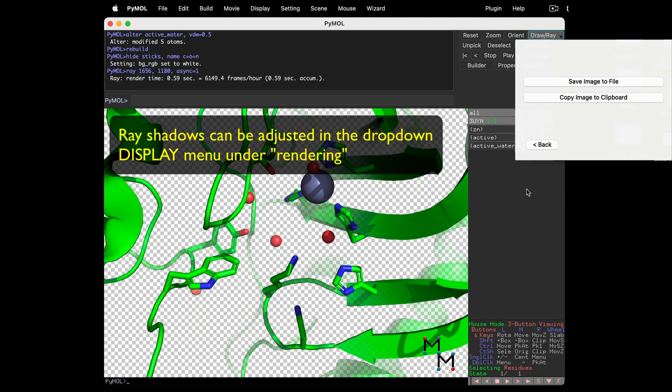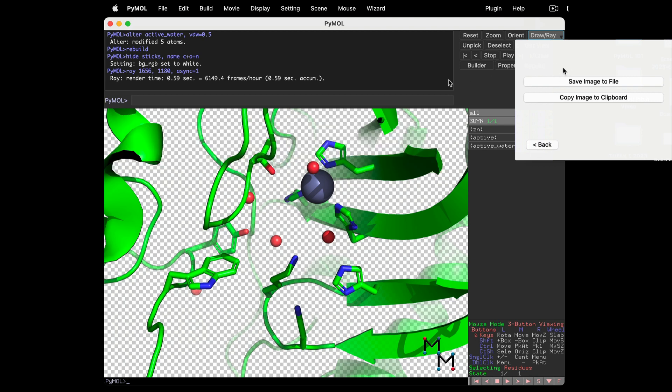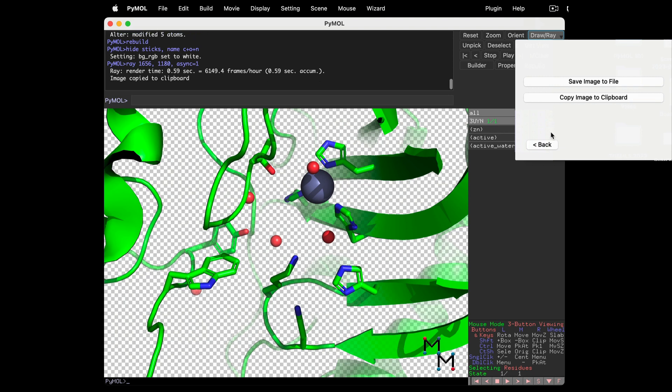Well, whether you choose to draw or ray here, you'll get the option to save the PNG or copy the image directly to the clipboard, which I find very useful.